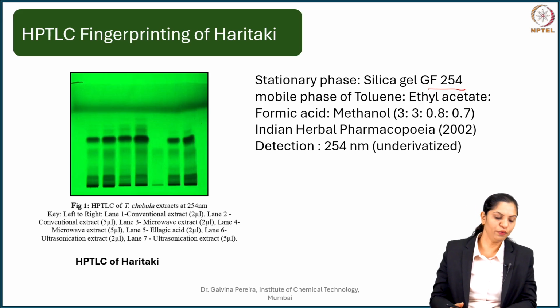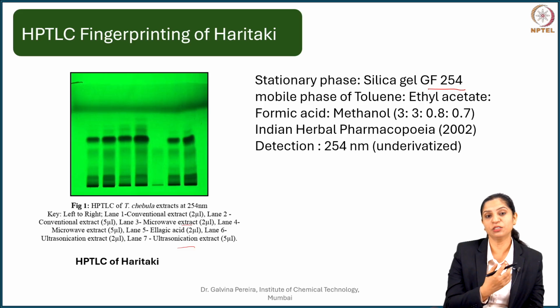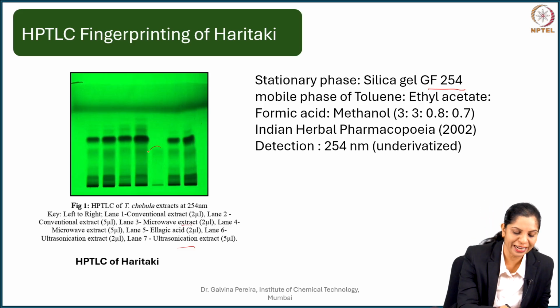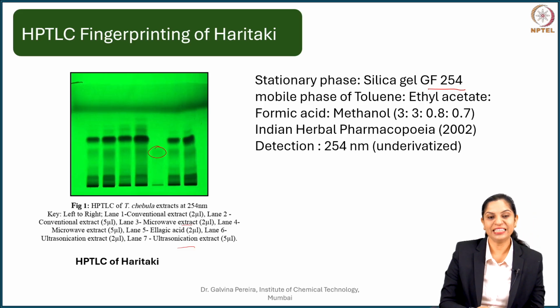So you can see in different lanes here in this paper, they have done extraction by conventional extraction, microwave extraction, or even ultrasound extraction and so on. So they have compared, and to quantify which one is better, they have used here ellagic acid standard. This other compound which is very dark is gallic acid. So both gallic acid and ellagic acid can be used as markers of Haritaki.